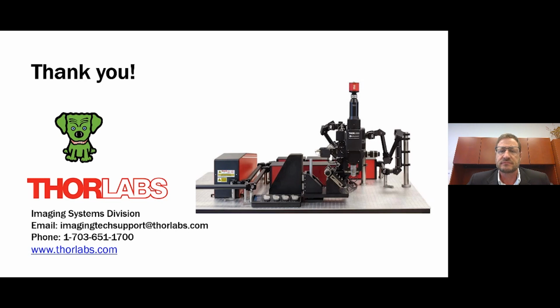Thank you. A couple of people asked a similar question: what about doing FLIM in combination with 3-photon? Yeah, it's certainly possible because we're really only looking at the decay of the fluorochrome. So certainly we should be able to look at 3-photon also.